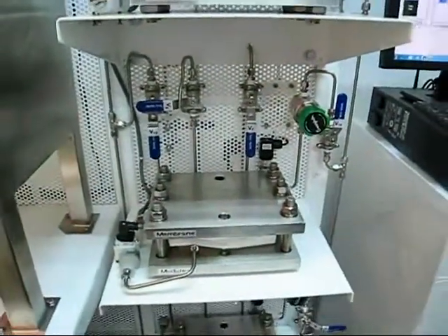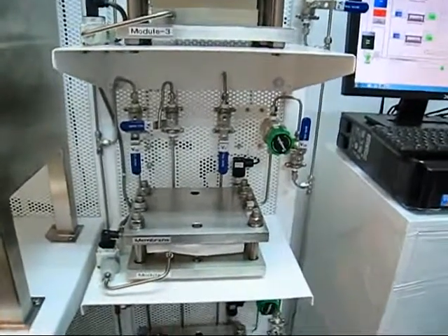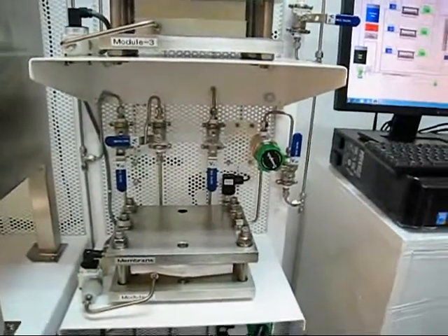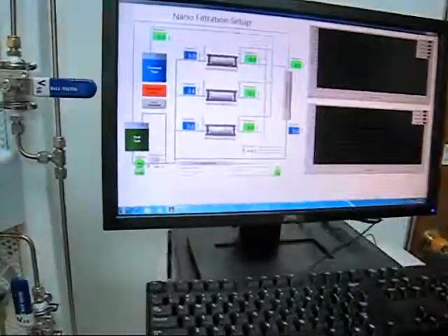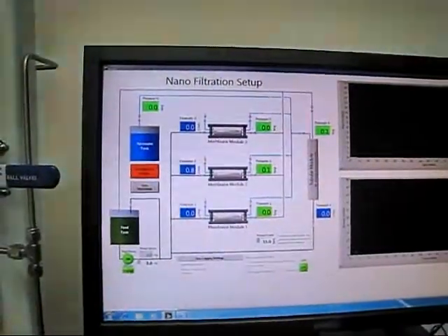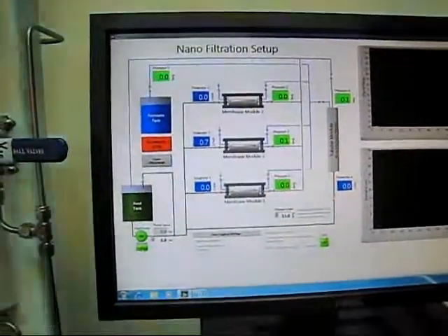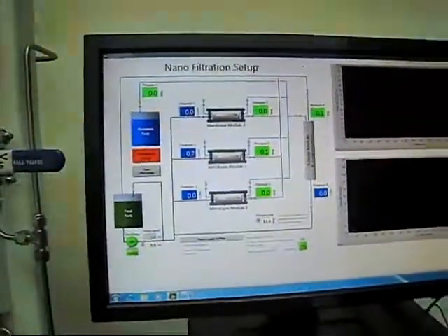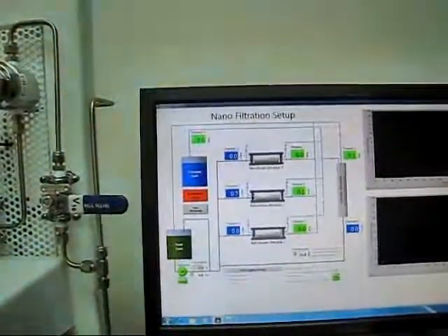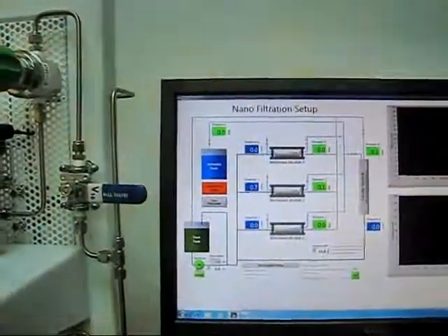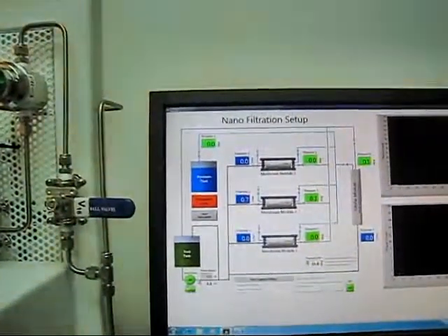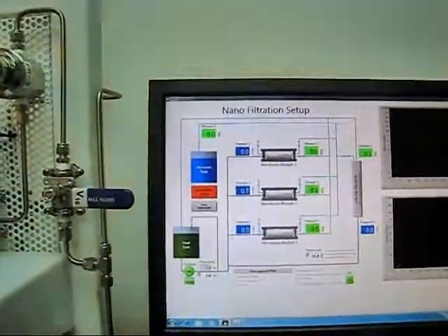I've turned on the permeate valve V7. The flow now into the membrane system is very steady, going at about 0.7 or 0.8 liters per minute with very minimal pressure buildup. Right now what I'm going to do is increase the flow rate very slowly. Preferably you should let the membrane season a bit—let it run for 2 or 3 minutes to ensure that the membrane is fully wet on the surface.